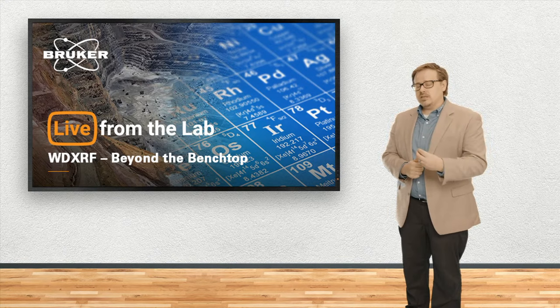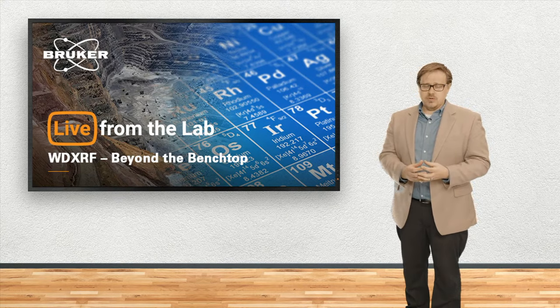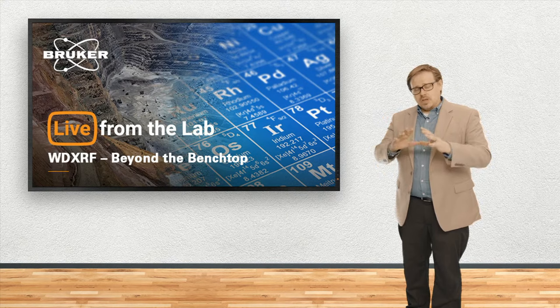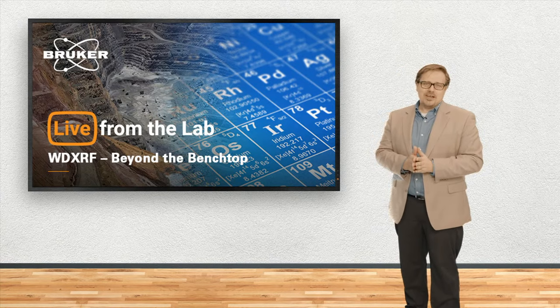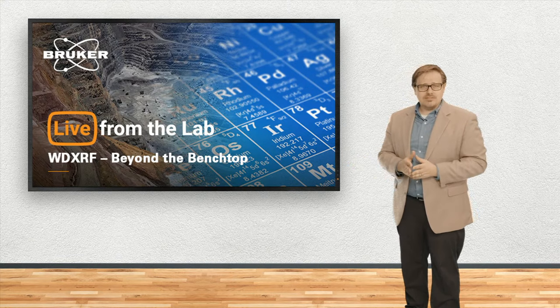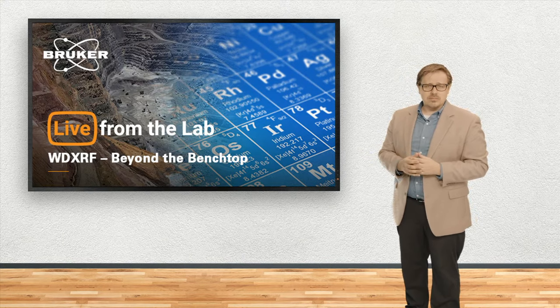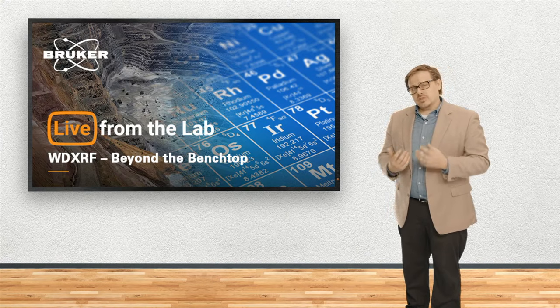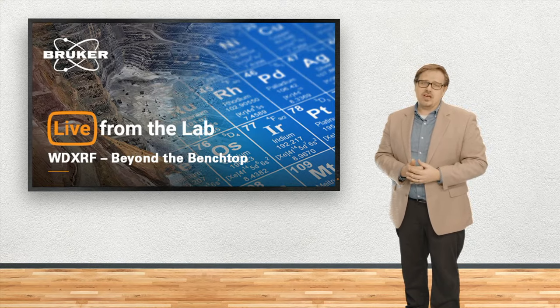It gives you the elemental composition. So other techniques, such as X-ray diffraction, deal more with the structures that are present or the phases that are present. A technique like X-ray microscopy will give you an idea of the overall morphology of the sample. In fact, one example I like to use sometimes is to talk about baking a cake. So with XRF, that'll tell you there's carbon present, there are all these different elements that are present, but it won't necessarily tell you how they're present. XRD, on the other hand, is going to tell you if there's sugar or flour, things like that. And then XRM is going to tell you how that's all arranged. So all important pieces of the puzzle, all important tools to have in your toolbox.